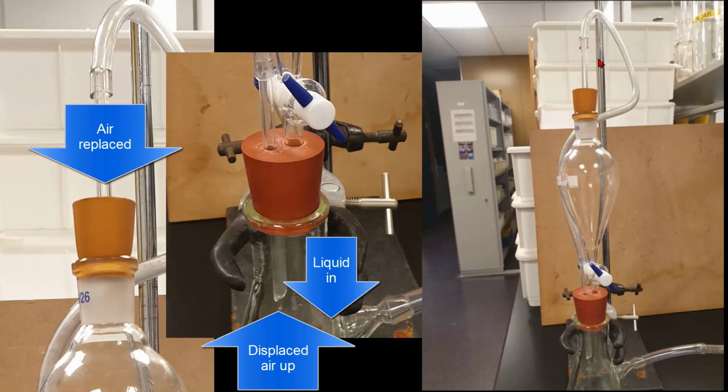And so that's just a cheap version, pretty much just a free version, using some tubing and some glass and tubing to create that pressure equalizing funnel. It also is not going to break, and if it does, it's plastic and bendable. This bit could still break, which is expensive as well, but is a lot cheaper than a couple hundred dollars.